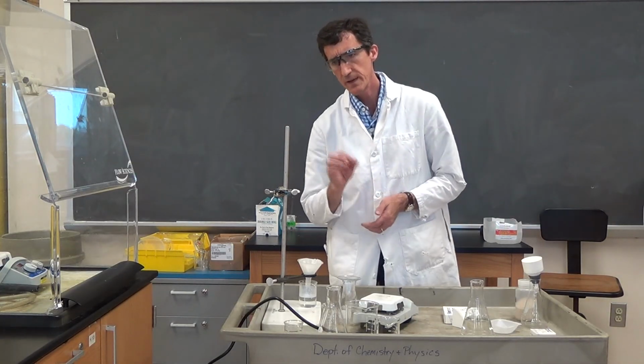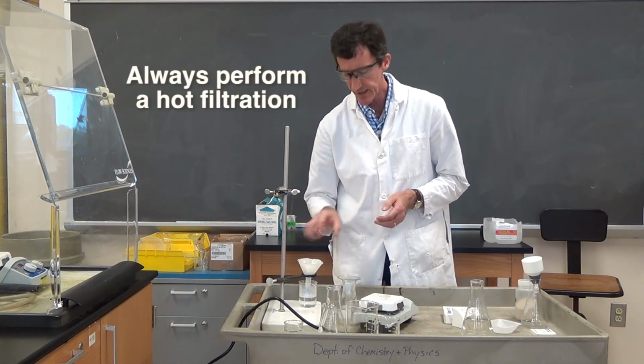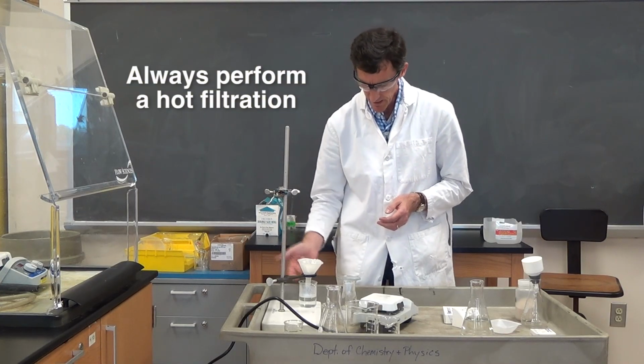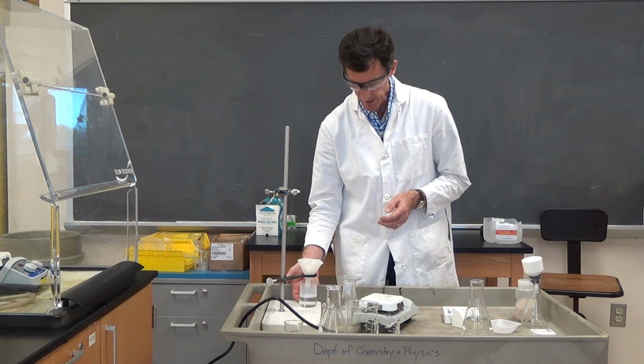During your lab work, you may not have insoluble impurities, or at least you may not think you do. It's always good practice to do a hot filtration. Always do this. If you hot filter, there's certainly no insoluble impurities now in your recrystallized fraction.